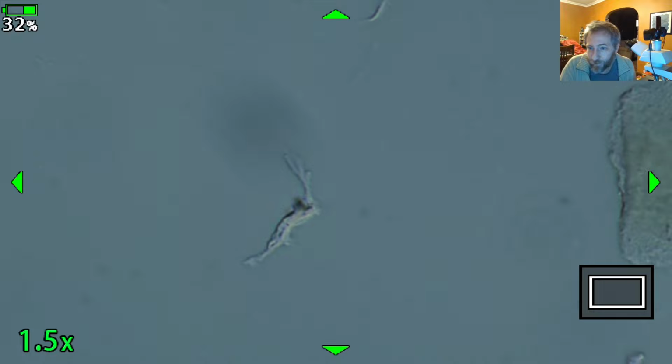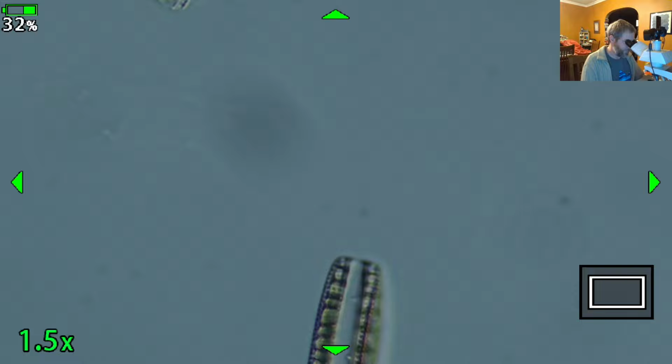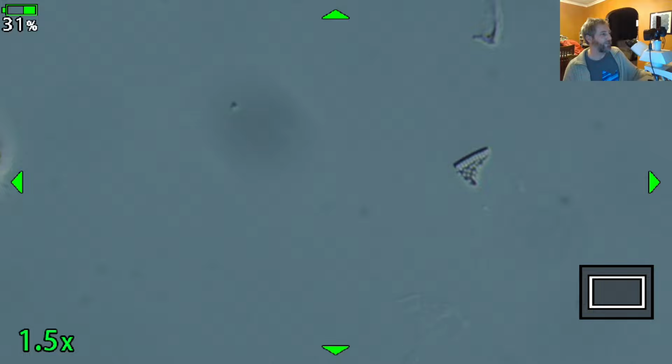Green Dish Towel says I used to have a microscope at home that I bought with my allowance money. It was about $200, but then I moved away and traveled a lot, so I sold it. You can get a pretty decent microscope for $200. This one is considerably more than that. This is my university microscope, and it cost us about $30,000, partly because it has this really fancy camera attached to it. The camera costs like $800, and the software that runs the camera and lets you measure and take pictures cost like $2,000. I decided that my camera is better than this camera and that I don't need the software because I can just do things through OBS. But when I bring it back to the lab, I'll put that back onto it, and my students can't use my camera from home, so it works out.